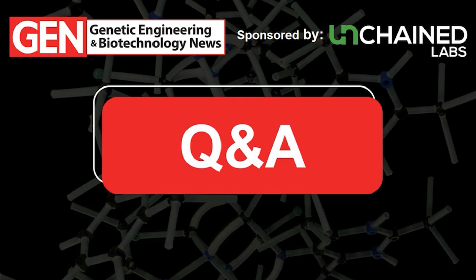That's one requirement. The other requirement is that, for the best results, you want to have a sample that's been somewhat purified. So if it has a lot of free DNA floating around in it, it's easy just to treat that with a nuclease and get rid of it, and that's going to give you the best results. It can still deal with those samples, but you're going to want to have a conversation with us about how to analyze that properly.